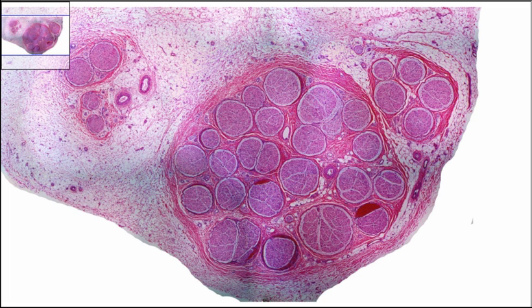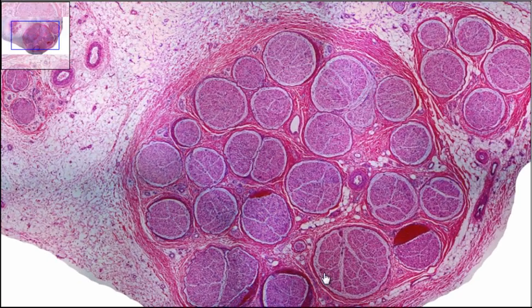What we're looking for are the different structures and features that make up a nerve. The first thing to look at is this nice large nerve bundle right here. If you look around the outside of the nerve bundle, you can kind of see this pink line that's running around the outside. If you zoom in a little bit, you can get a little better picture.